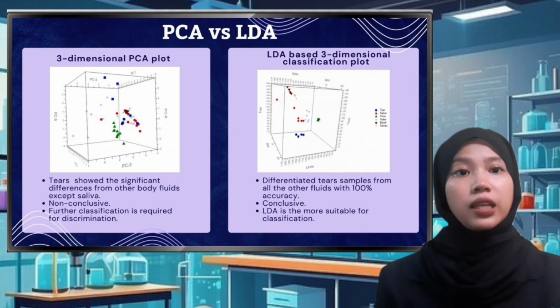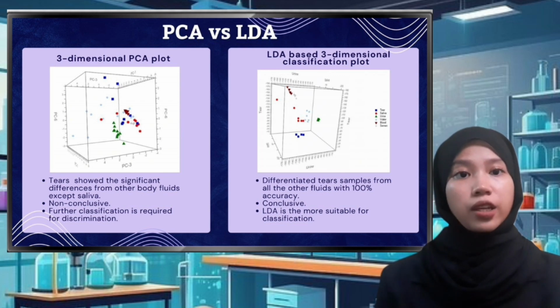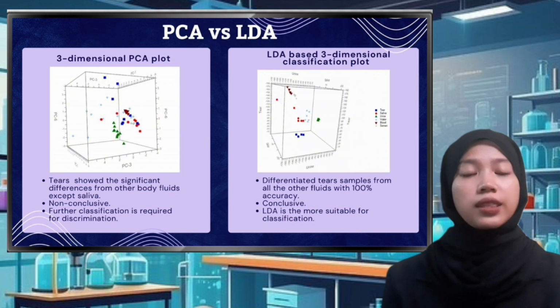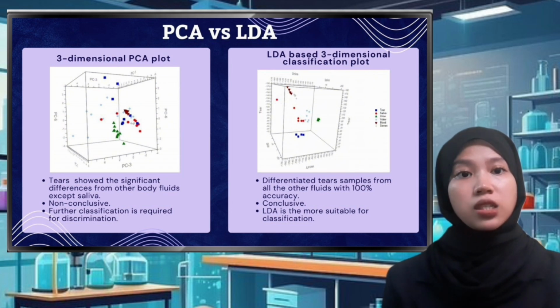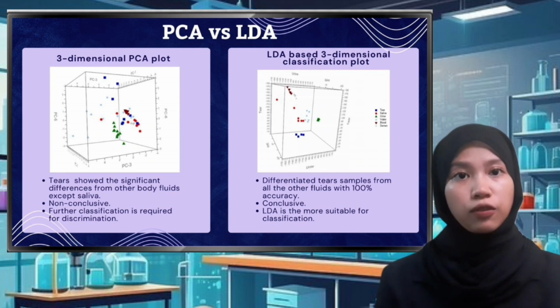By implementing the linear discriminant analysis (LDA), the study successfully differentiated tear samples from all of the other bodily fluids, including water, with 100% accuracy. This proves that the LDA-based 3-dimensional classification plot is conclusive and is more suitable for the classification of bodily fluids.